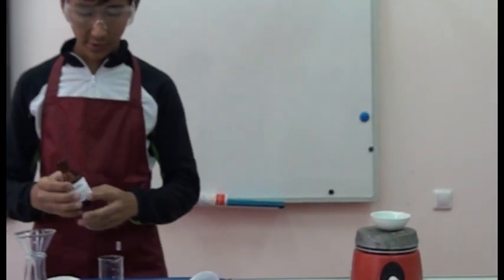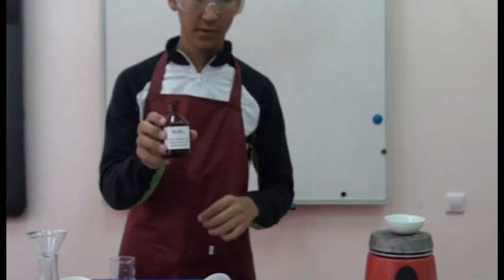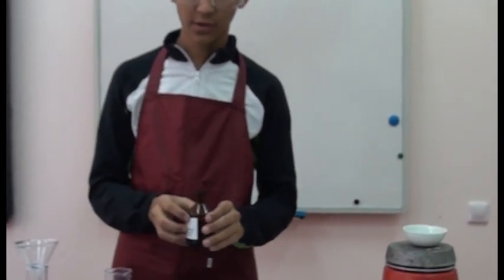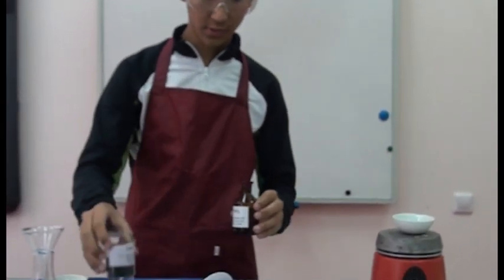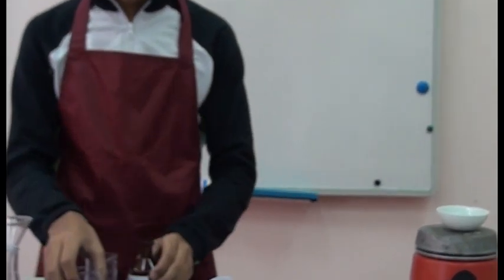And today I will demonstrate to you the experiment of getting copper sulfate. So here we go. There we have sulfuric acid, and we must heat it before the reaction between the copper oxide and sulfuric acid.